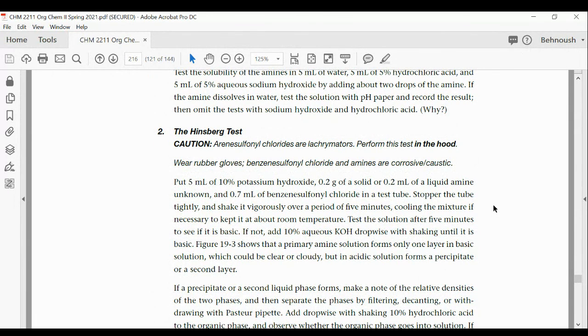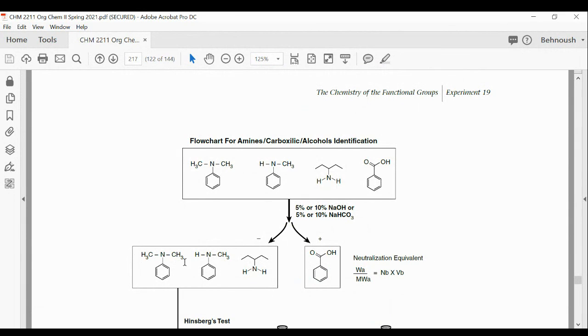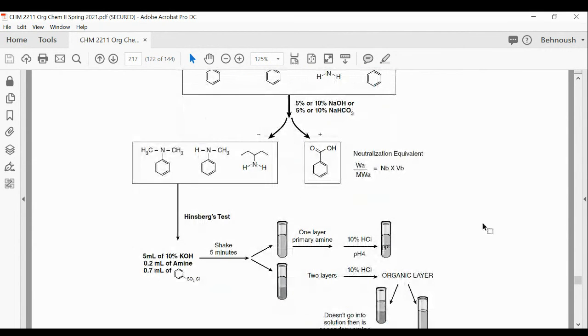I do have another question. When it says a liquid amine, for the known sample, I already knew which amines they are, because the bottle had the name, and I have the name in here too. So we know which ones we used. You haven't done the unknown yet. They were the known samples, so I was practicing with the primary, practicing with secondary, and practicing with tertiary. So when you have an unknown, this will happen, exactly.